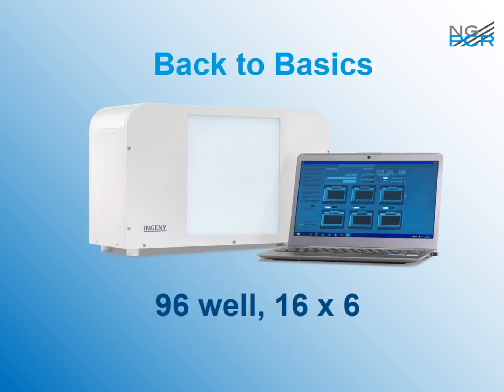And so we did. We made this machine, and it had a polypropylene foil with 96 wells that we could fill with 96 PCR mixes and then close. So then we ended up with a plastic foil with 96 blisters filled with PCR mix. But we tried to make it small, so we took a quarter of a microtiter plate, we spaced the wells 4.5 millimeter, so we ended up with 16 times 6. That's a quarter of a microtiter plate.